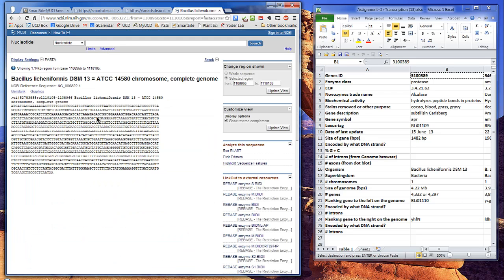FASTA formatted files are really useful because they can be used in lots of different types of bioinformatics programs. The one we're going to use is called Sequence Manipulation Suite.